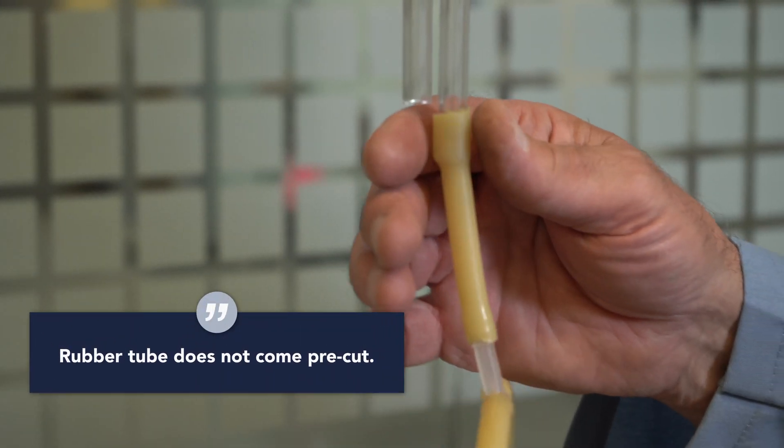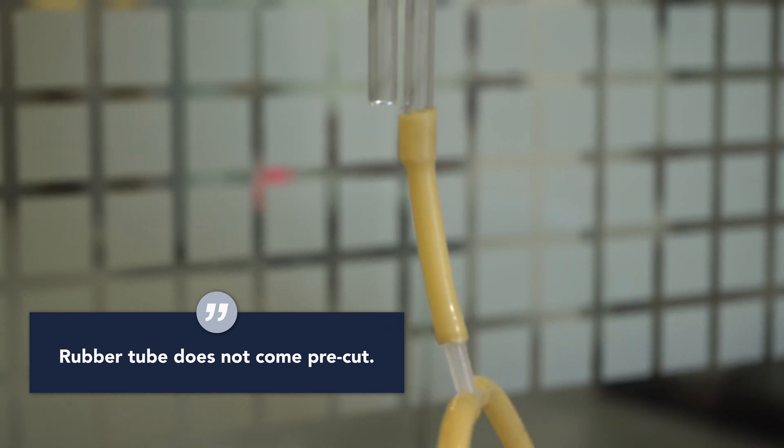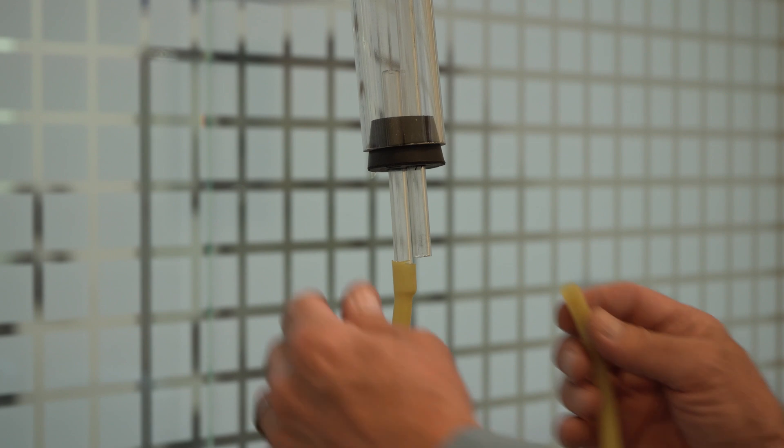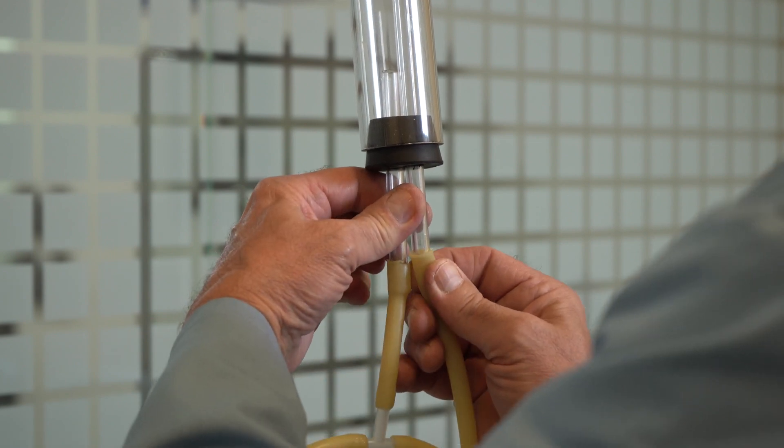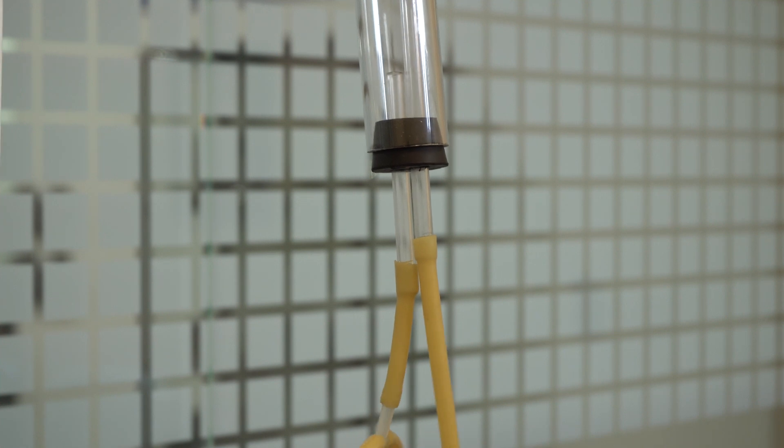Step six: use the three inch piece of rubber tube and attach it to the lower outlet in the flow meter assembly. Step seven: the longest rubber tube attaches over the end of the higher outlet on the flow meter assembly.